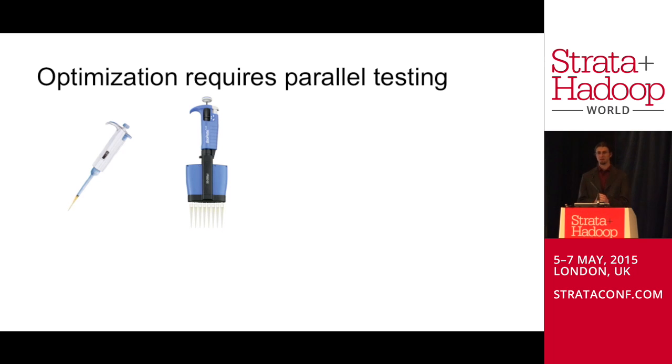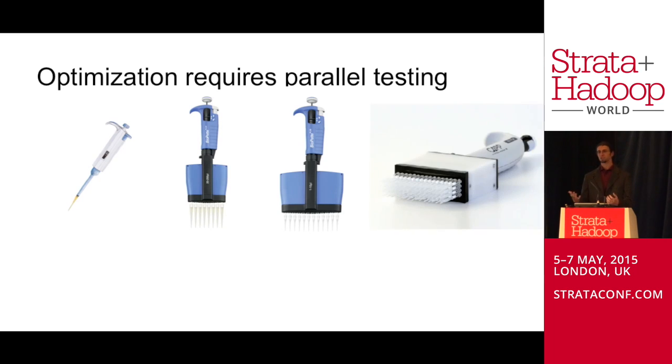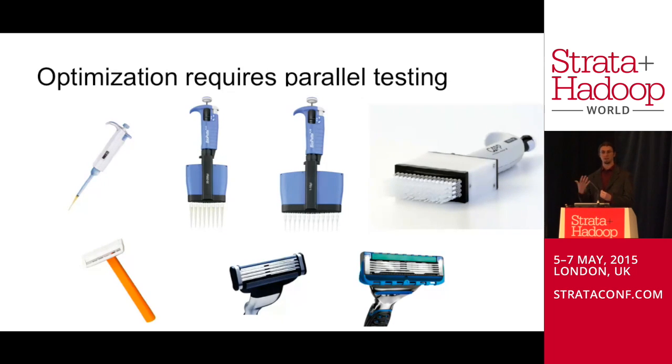This multi-channel pipetter can work on 8 wells at a time. Of course, why stop at 8 when you could have a 12-well multi-pipetter? Or actually, if you wanted to really go crazy, they make 48-well multi-channel pipetters as well. So now you can get a decent amount of throughput by hand. But fundamentally, while certain industries have made great strides in incrementally improving a small hand tool, this really isn't going to take Zymergen where it needs to go.